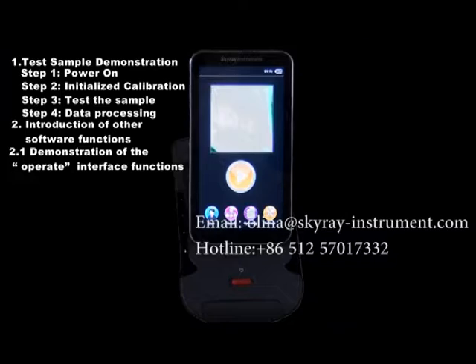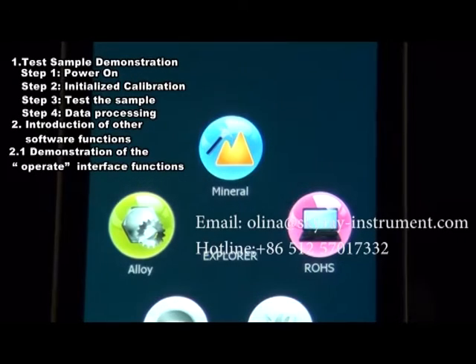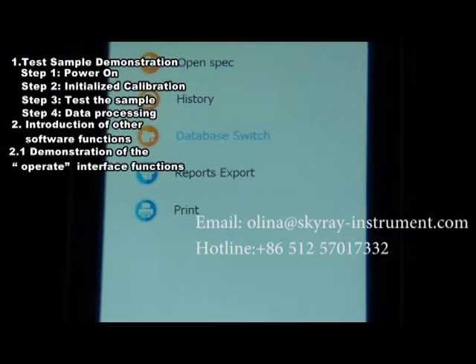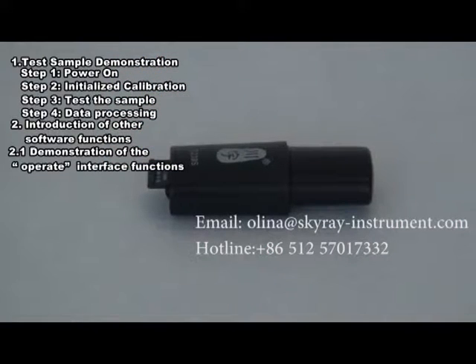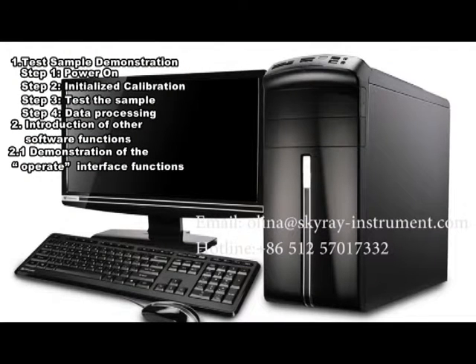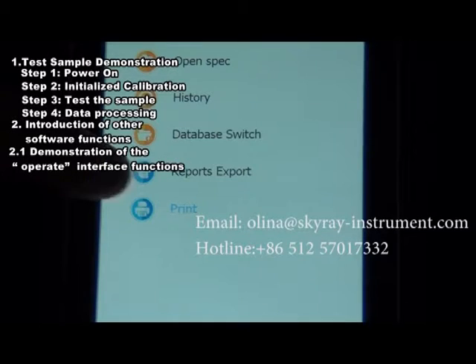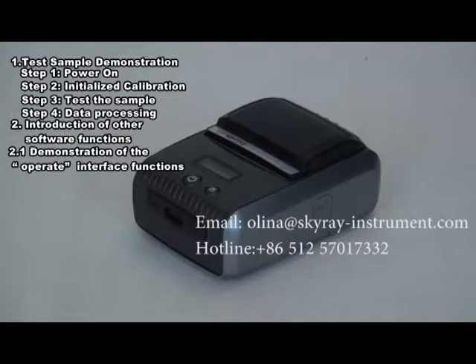Section 2.1.3: Database Switchover. Click Database Switchover to select the Industrial Database Spectrogram. After selection, the software will automatically reboot and enter the main interface. Section 2.1.4: Report Export. Click the Report Export button to export all saved reports to a memory card, which can then be copied to a computer for printing. Section 2.1.5: Print. Click the Print button to connect to the Bluetooth printer and print the test report for the current sample.